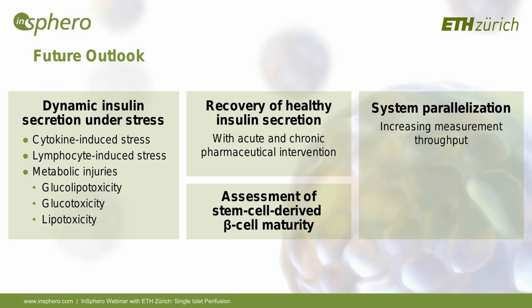Having set up the two model systems and created this platform, we now would like to enter disease modeling and drug development. And for this, we would like to first look at how dynamic insulin secretion is influenced by stress, using different injuries such as cytokine-induced islet stress, lymphocyte-induced islet stress, or other metabolic injuries such as glucotoxicity, glucolipotoxicity, and lipotoxicity.